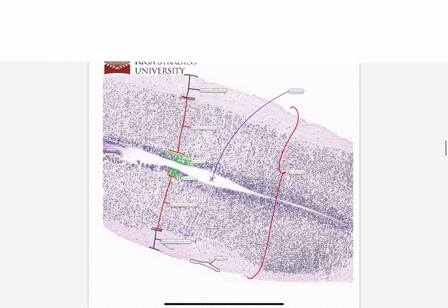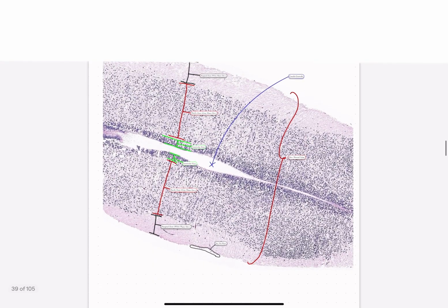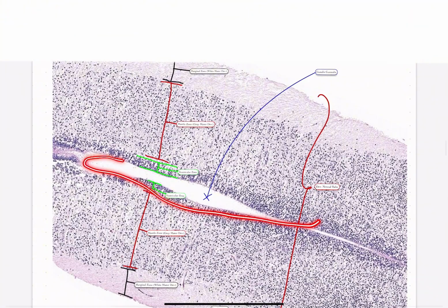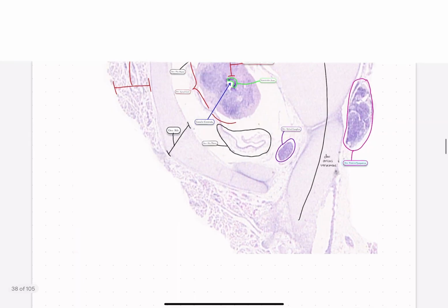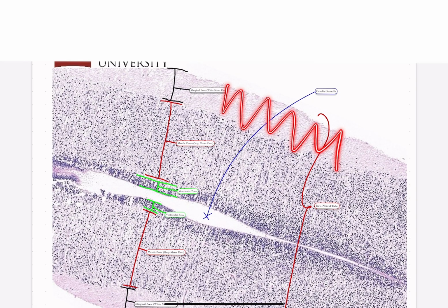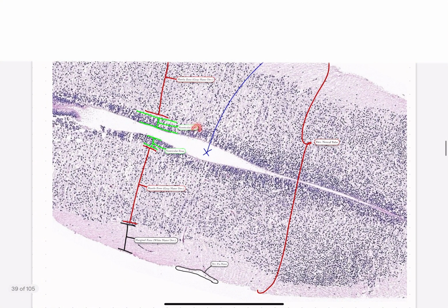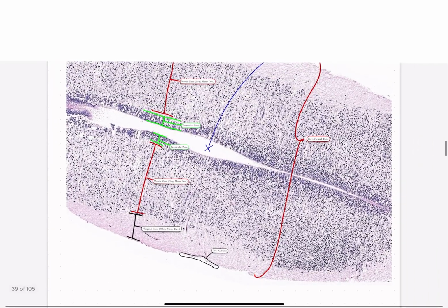Okay, here we go. Here we can see in longitudinal cut the neural tube, aka the spinal cord, but in this case it's a lot younger, so this would be the neural tube. And here we can see the opening, the canalis centralis. Now it's again in longitudinal cut, not cut in a transverse section like this. And then we have the marginal zone, which is this wider area, the mantle zone, which is a little bit darker and larger, and then the ventricular zone, which almost appears black if you zoom out more. And below the marginal zone, we have the developing pia mater as well.